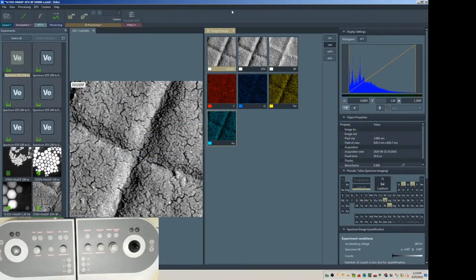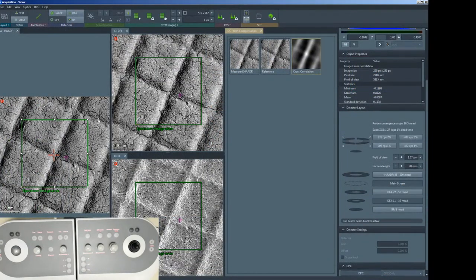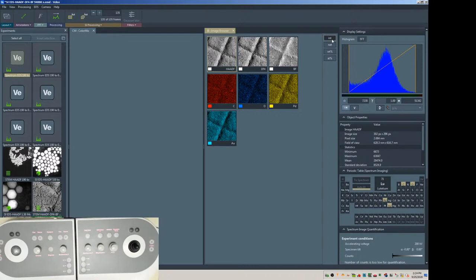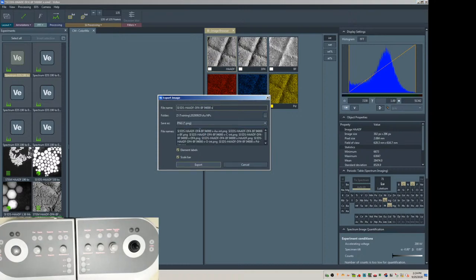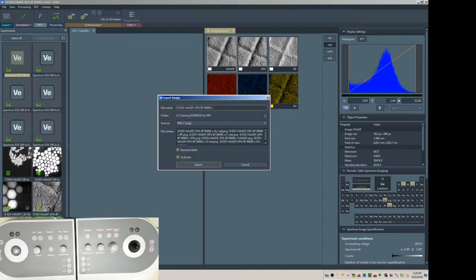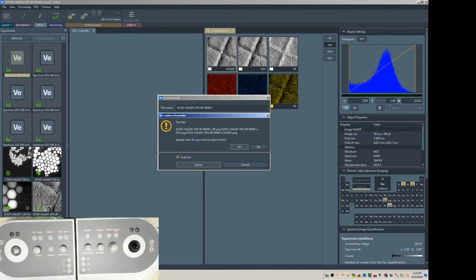Okay, so I think right now we can stop it and come back to here, right click. If you select the integration intensity, right click, it's gonna save the files as int. But if you also want net, you click net and export all, it's gonna put net, N-E-T, at the end of your file name, because these three images won't have any N-E-T or I-N-T in the file name, so it's gonna ask you to confirm overwrite. I usually just click yes.